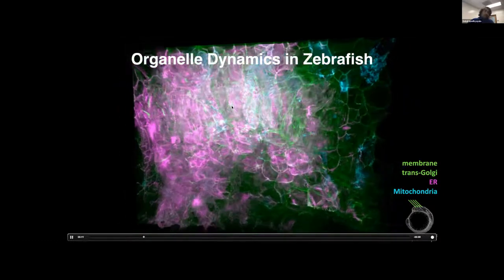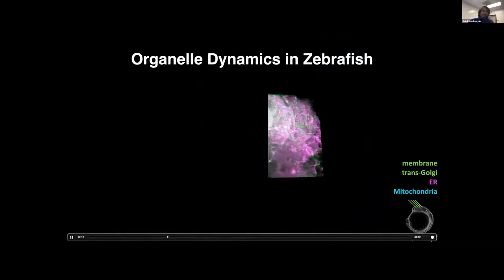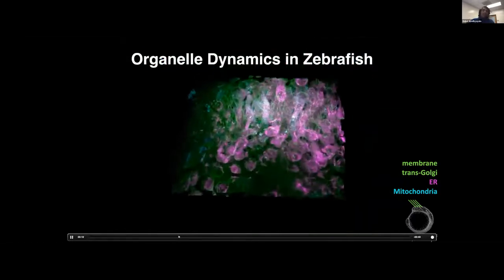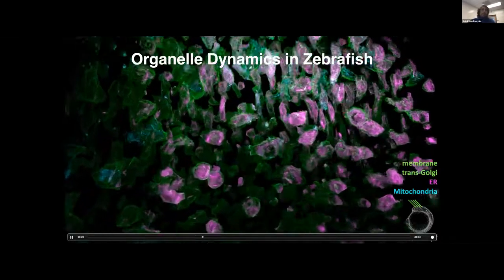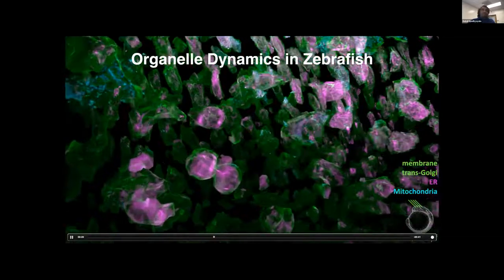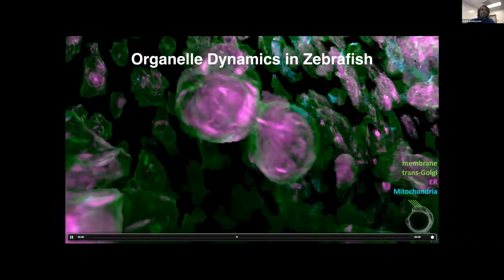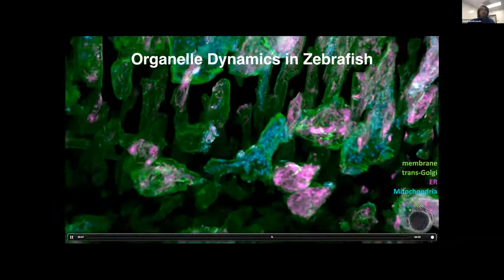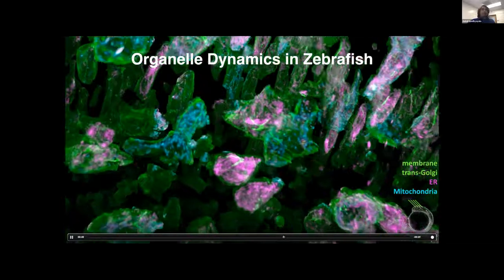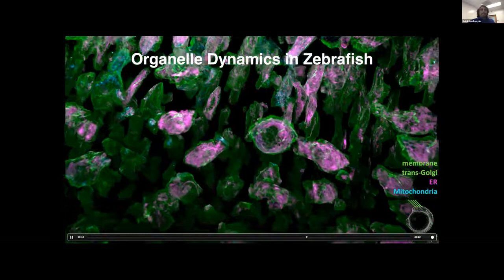And then what we did was we computationally separated out each cell such that you basically have a view of individual cells as one is used to studying, but with a preserved morphological context of all of these cells. So in this case, you can see these dividing cells here. You can see these amorphous, blobby looking skin cells over here. This is the hindbrain of the zebrafish. So these are the precursor neuronal columnar cells over there. Another mitotic cell there.